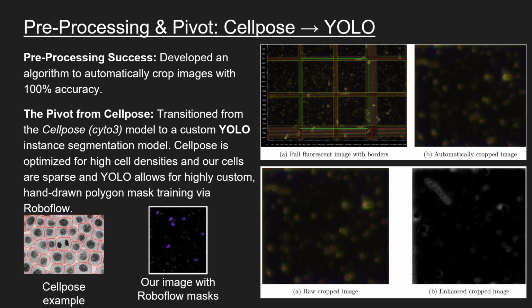The main issue we run into is that while we can accurately subdue or erase a glass imperfection, those glass imperfections will overlap with bacteria from time to time, and then you end up erasing bacteria as well, which we do not want. And so we've had limited success finding a balance there.